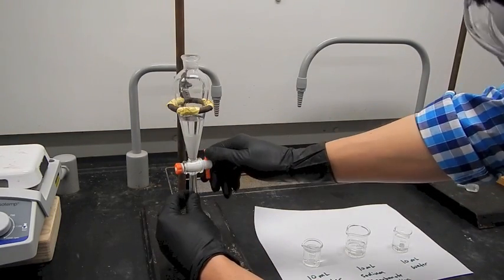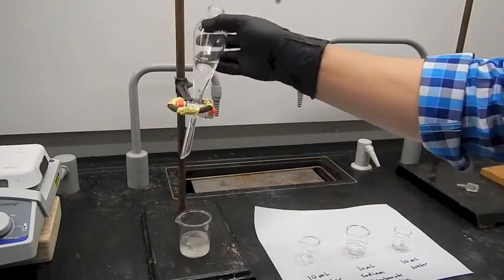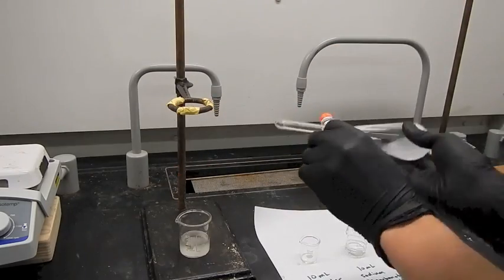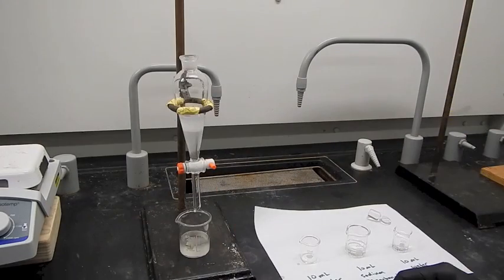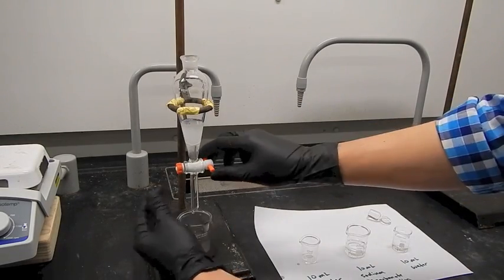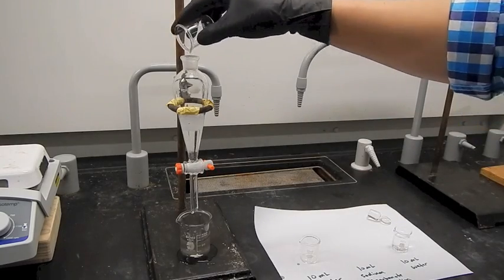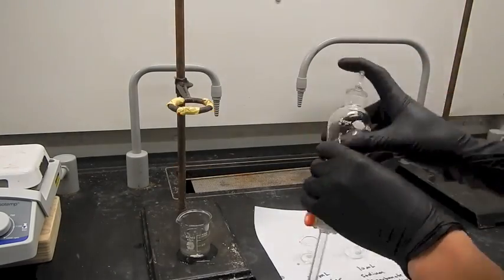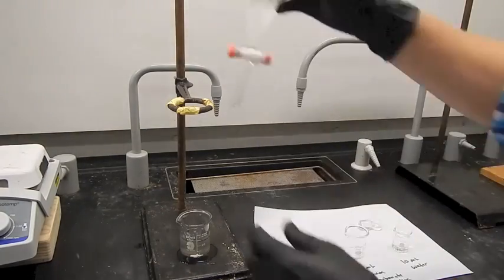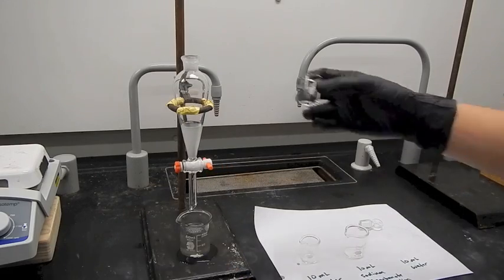Step 1 is going to be to drain the bottom aqueous layer. Now I'm going to add my water wash. And as soon as it settles, I'm going to drain off the bottom layer and continue with the washes. Sodium bicarb. And my last water.